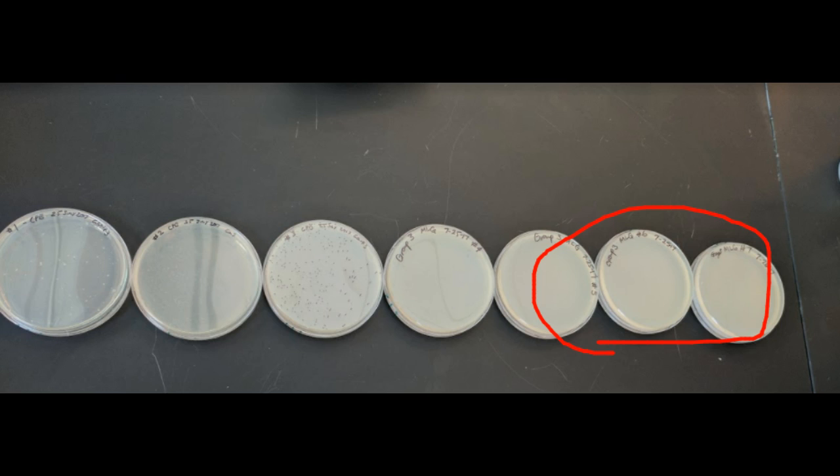Now, over here we see it's really clear. There's too much clearance. There's nothing to count. There are no microbial communities. I mean, there are some very tiny ones you can see here. But then over here, there are too many colonies. So somewhere in the middle is going to be the perfect situation where you have just enough colonies to count them.